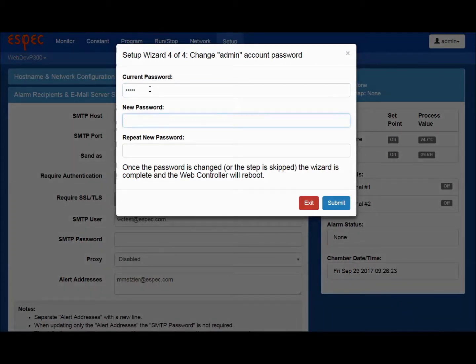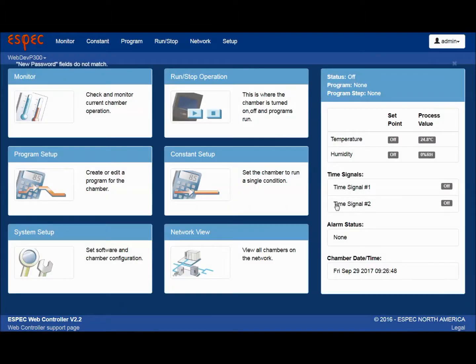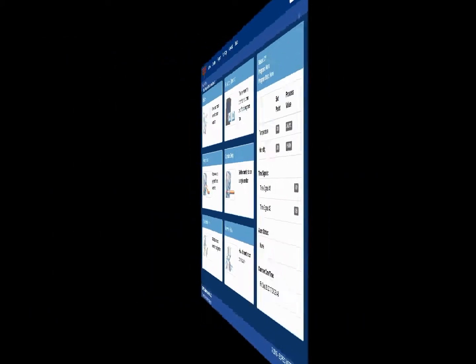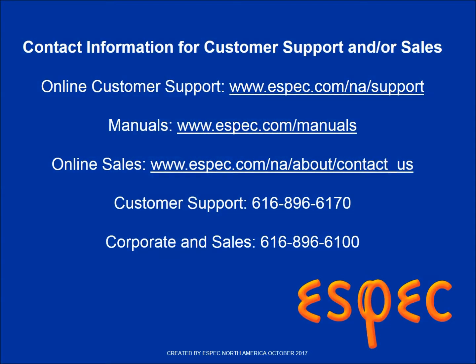Your web controller is now set up and ready for use on your computer. You can easily monitor the conditions, set up programs, and collect data for analysis, all from your PC. If you have any additional questions, please reference your chamber manuals or contact ESPEC customer support.